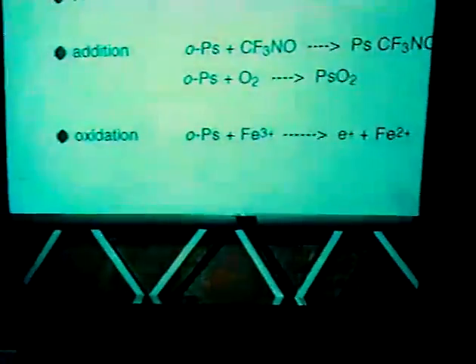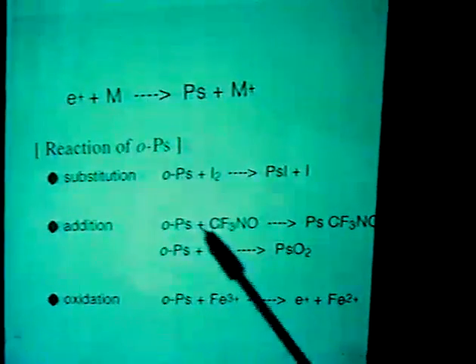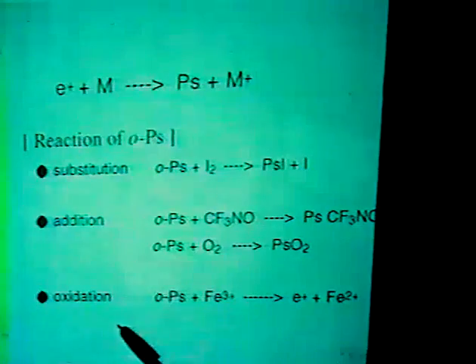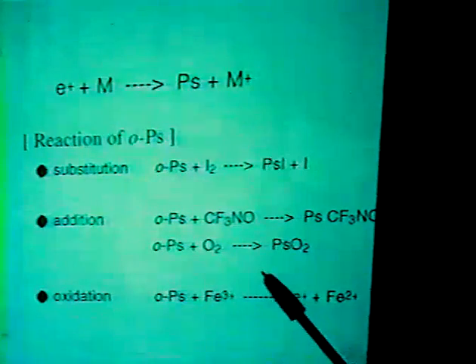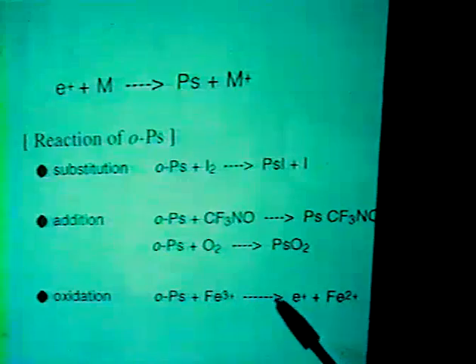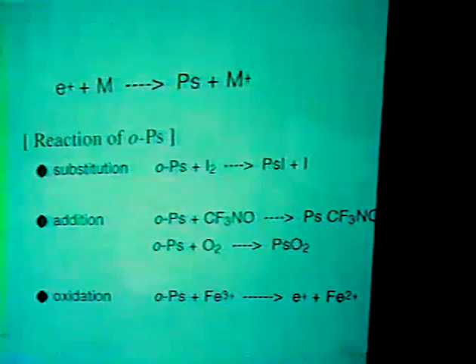This point is about 100 millimeters. The change of lifetime and the change of oxygen absorption started at nearly equal oxygen pressure of 100 millimeters Hg, as I showed in the lifetime step.